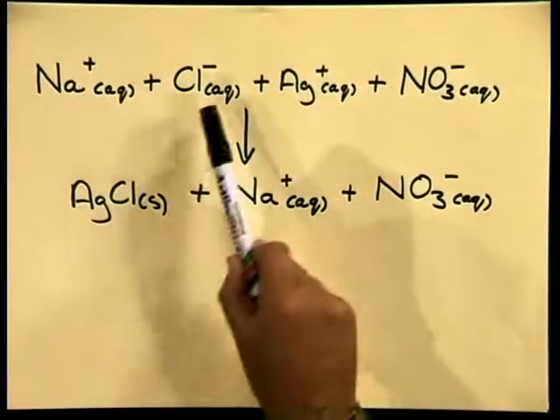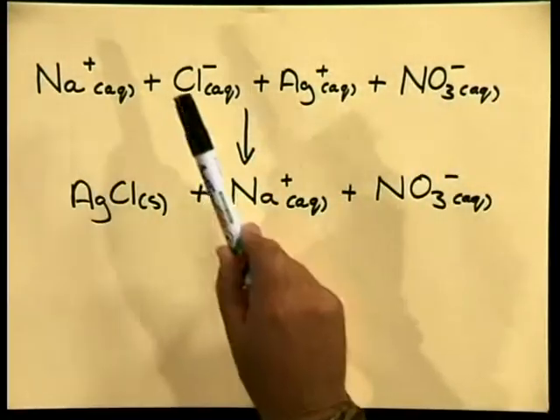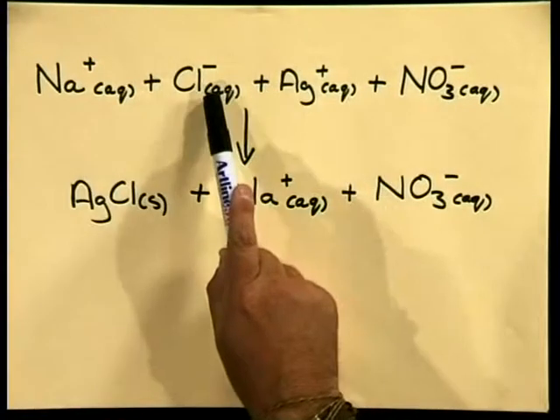Now let's see what happens when we add these solutions together, more specifically the interactions of these ions. The ions are all in the same beaker and can move freely in the solution. The positively charged cations are able to attract the negatively charged anions.